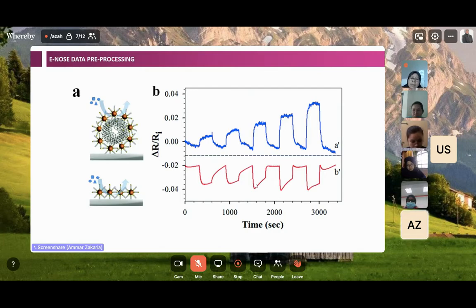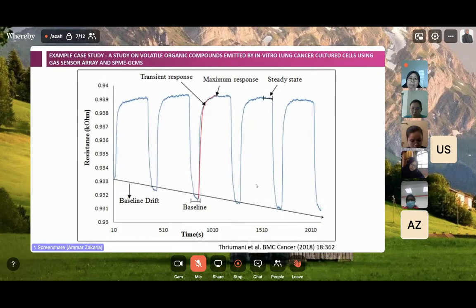Of course, the result will not be similar. You'll get a different result. Then you will get a headache analyzing this result. So you need to have a strategy. You need to plan out your experiments. Okay, so these are the real results that we have.